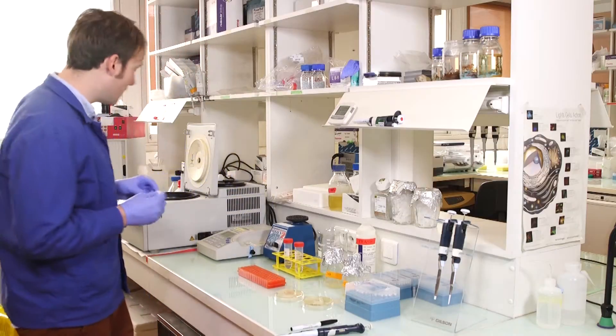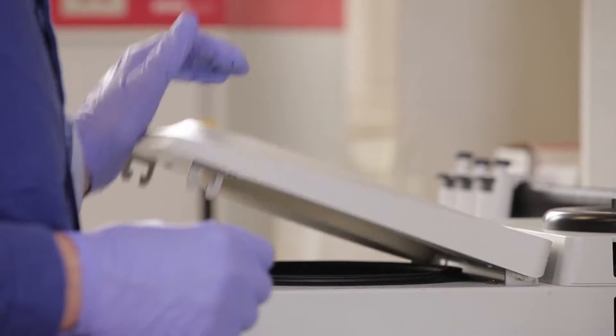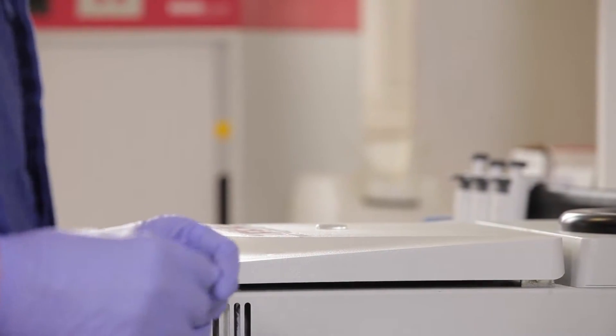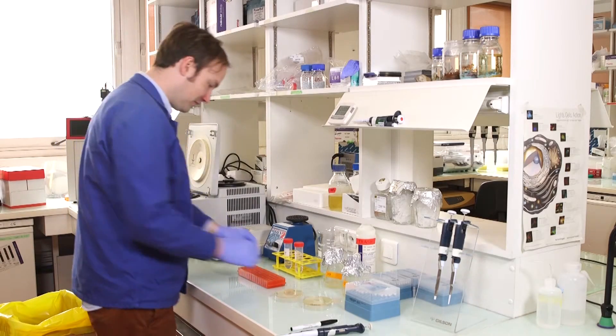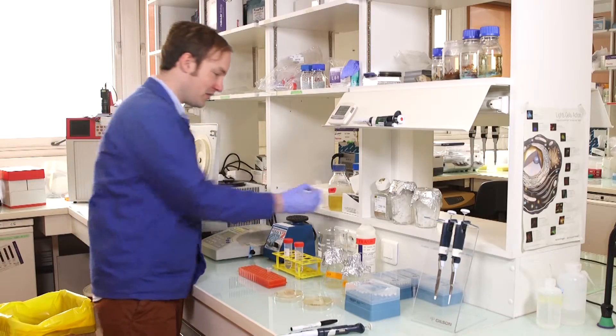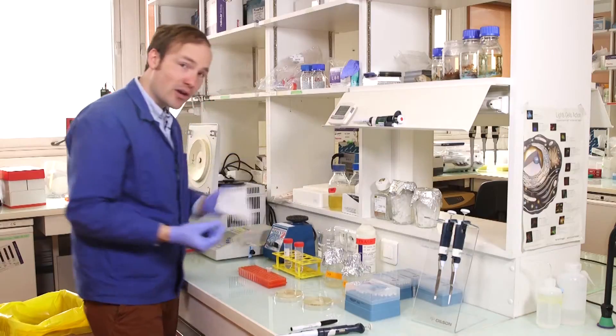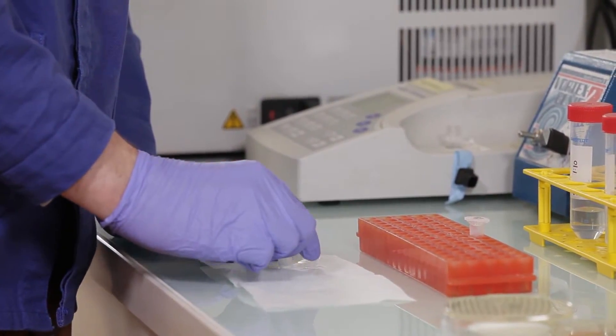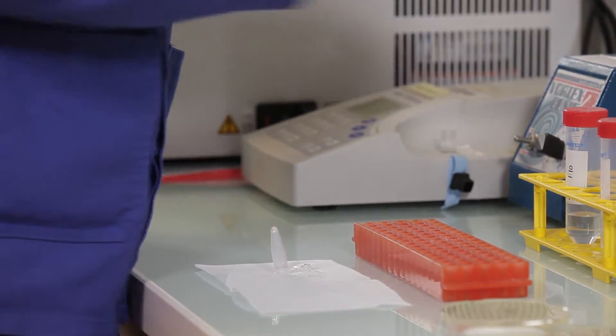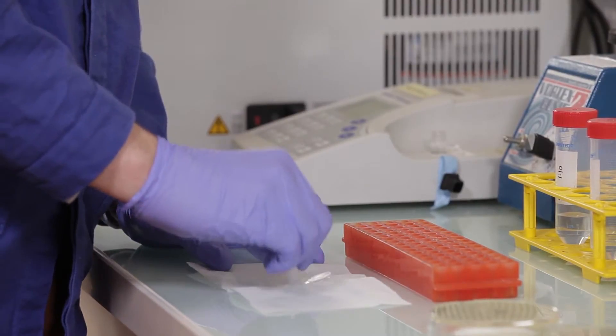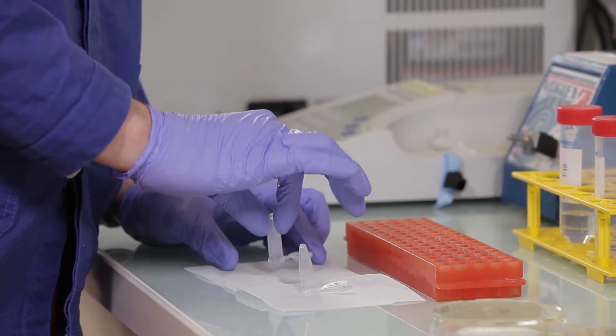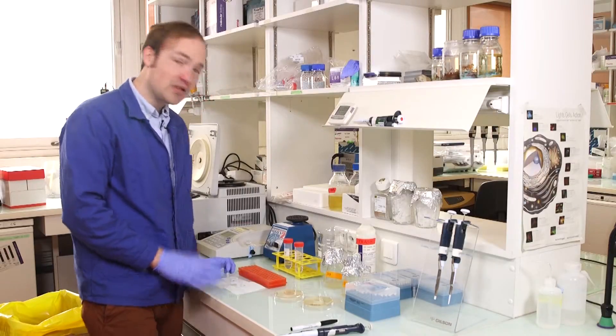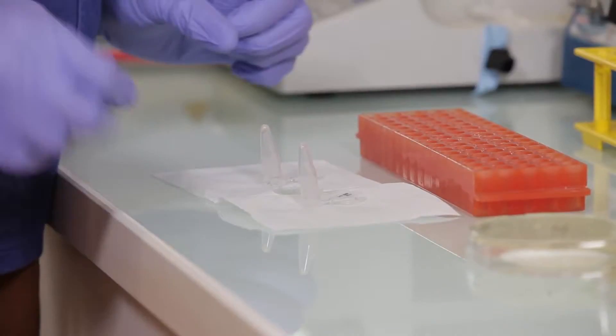So we take our 1 ml of cells into the centrifuge, spin them down, 30 seconds, maximum speed. Pop them out. Pour off the spent LB. And then what I'm going to do is invert these tubes on a sterile Kimwipe and kind of blot them. This will absorb just those last few drops of LB. It's also cleaner, like I don't have LB on my hands when I'm done. I like it. Dry them out a little bit. And you can see the pellet stays very firmly stuck to the bottom of the tube.